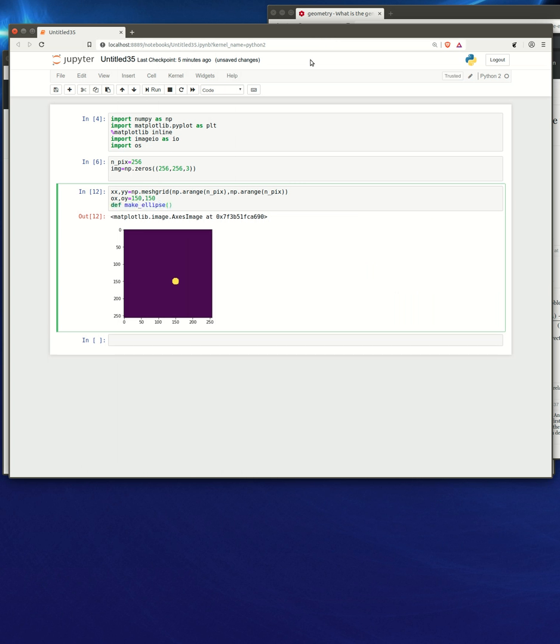This is going to be a function that takes the image as an input, and it will put an ellipse at some given location. This will be the location of the ellipse, and the x-axis, so the long axis will be axis 1, the short axis will be axis 2, and the angle by which we rotate it we just call angle. And this should be enough for the all-purpose image. Let's also put the grid as a parameter that it takes in.